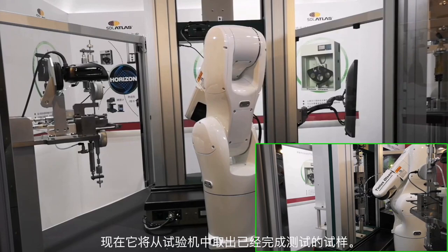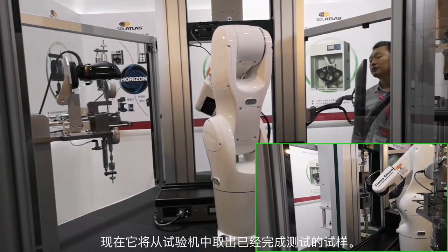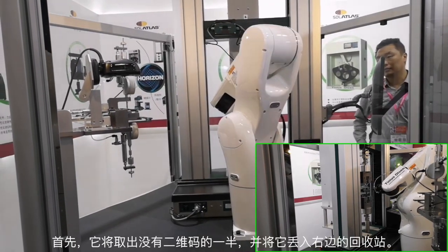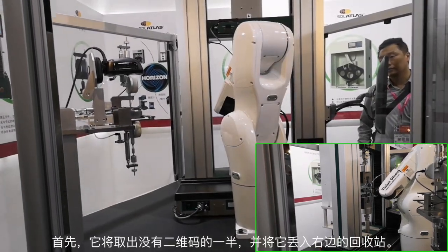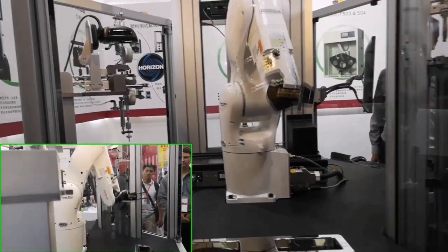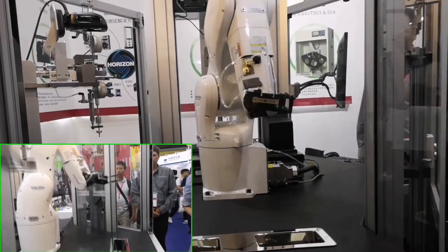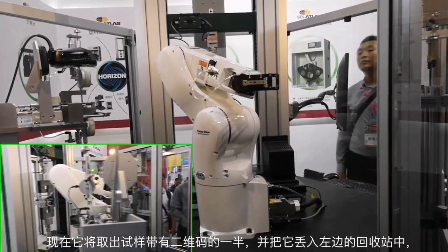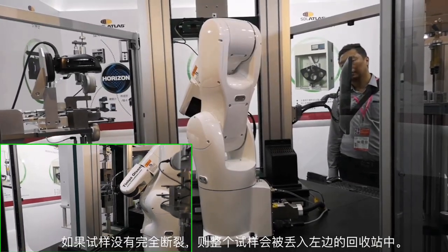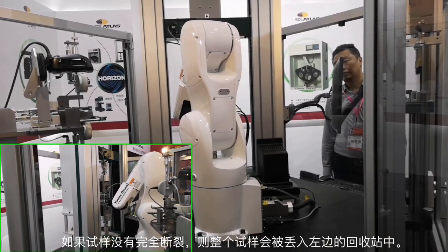All right. Now it's going to get the sample that has finished its test. It'll grab the half that doesn't have the barcode and dump it in the right bin. Now it's going to go and grab the half of the sample that does have the barcode and dump it in the left bin. In the case where the sample doesn't completely break, the entire specimen will be put in the left bin.